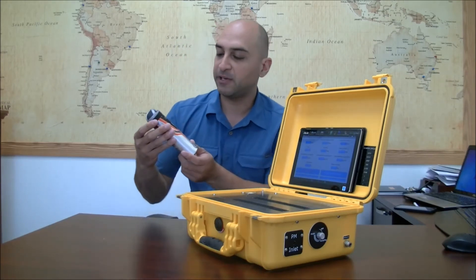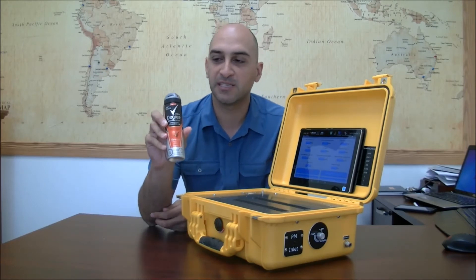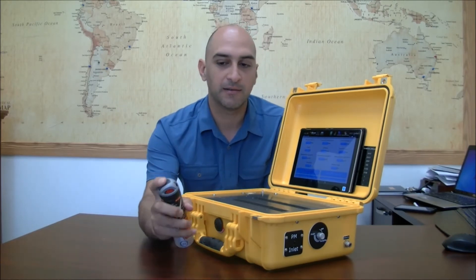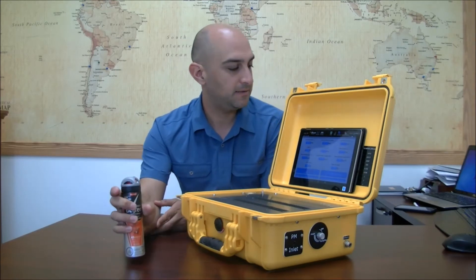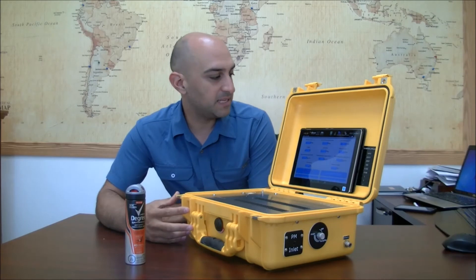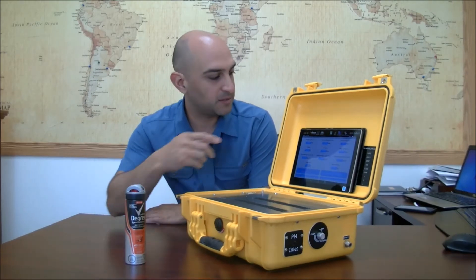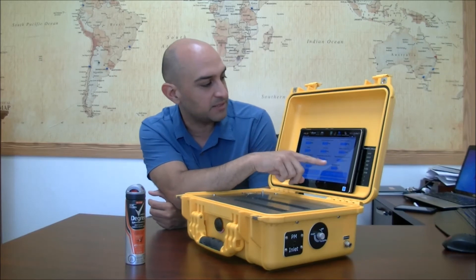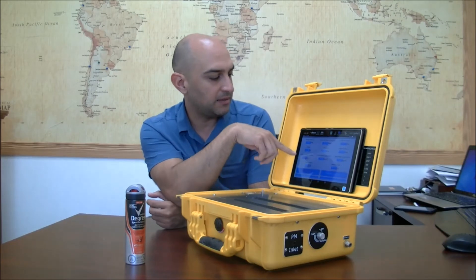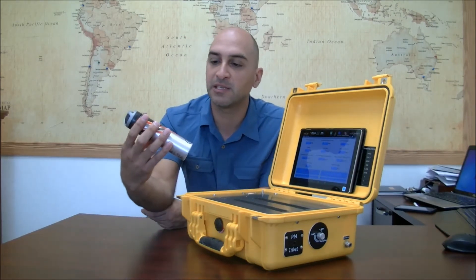I have with me a dry spray which is anti-spray, but it produces a lot of micro particles. So we're just going to spray it out a little bit. The good thing with the PM sensor is that it's really sensitive and very fast at the response. We can see it already went from 10 to 85 in the PM10 — 105 now. Not much in the PM1; I guess this is more of a larger particulate.